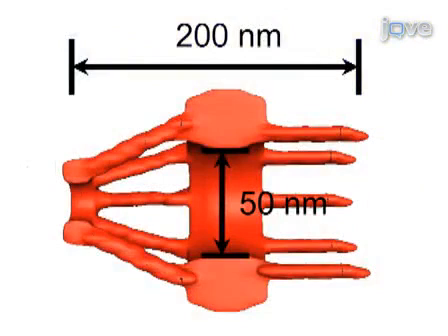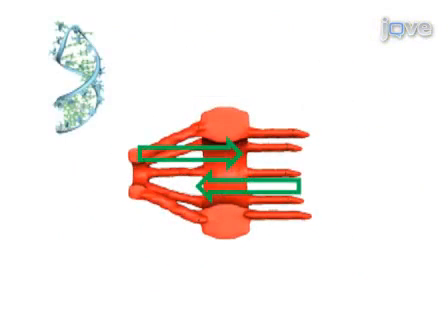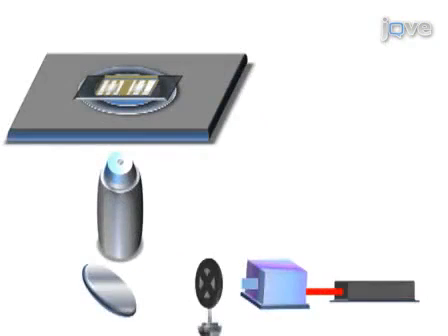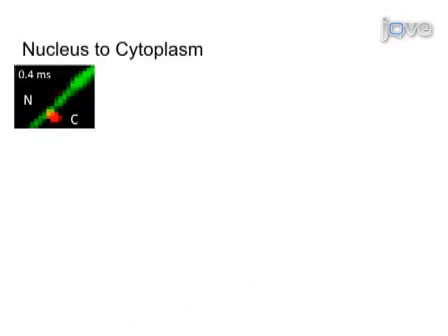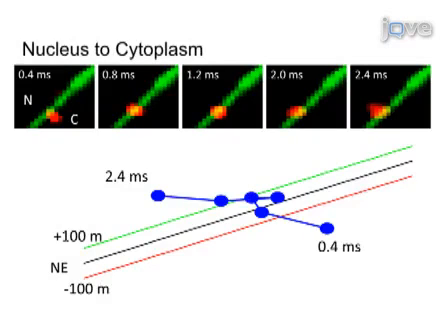The cell's nuclear envelope contains approximately 2,000 nuclear pore complexes that allow the transport of water-soluble molecules such as RNA, ribosomes, certain proteins, carbohydrates, and signal molecules. By adding labeled cargo molecules to permeabilized cells, the movement of single molecules through the nuclear pore can be visualized by fluorescence microscopy. Time-lapse images are required to determine localization, as well as spatial temporal characteristics such as transport time, import-export efficiency, and entrance frequency.